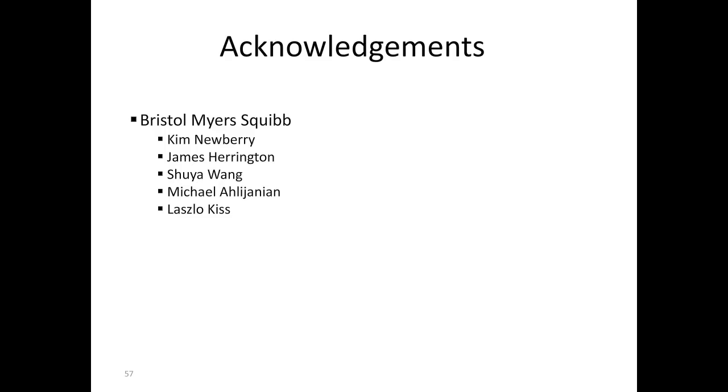All right, great. Thank you, Daniel. This next one is for Dr. Graef. A couple of similar questions here where our audience is wondering if you're able to isolate single units from the multi-unit activity at each electrode, and in conjunction with that, what is the diversity of your DRG neuron cell types? Do you know the distribution of subtypes in your system, and can you tell the different effects on these different subtypes with your pharmacological manipulation? Yeah, no, that would be great. No, I wish I did.